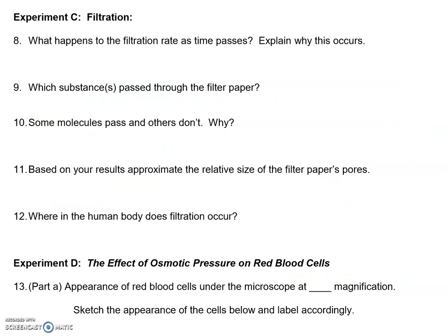Moving on to experiment C, filtration. I don't know if you got a chance to do this, but if you filter coffee or tea, you will see that the soluble parts end up in your beaker or in your cup, and the insoluble grinds or the tea leaves stay back in your filter paper.